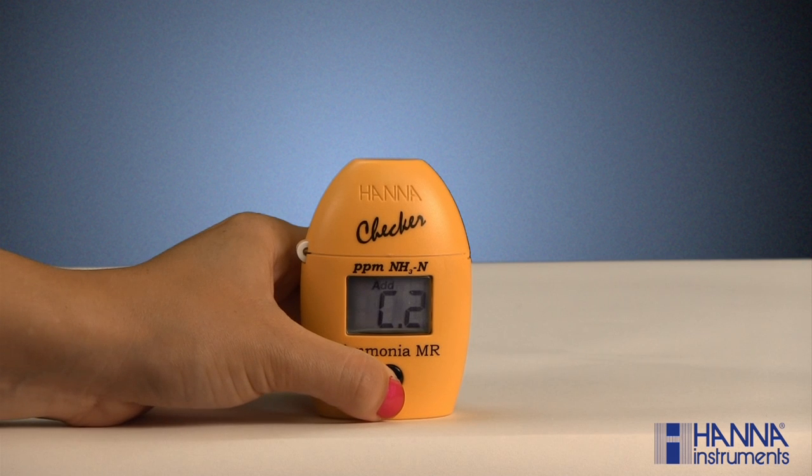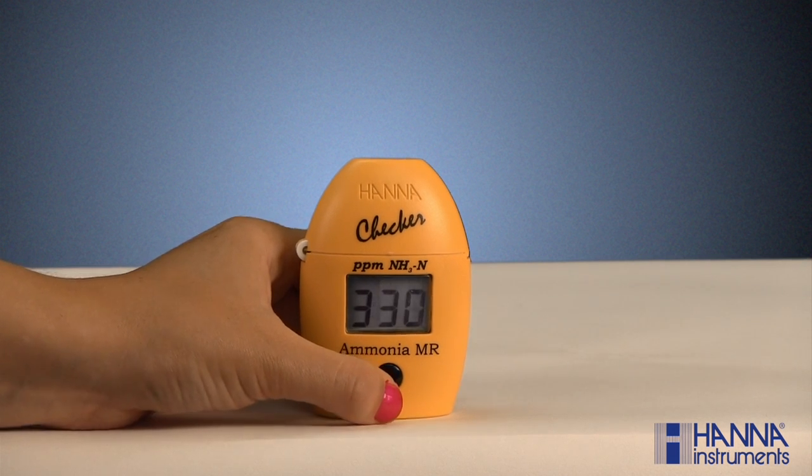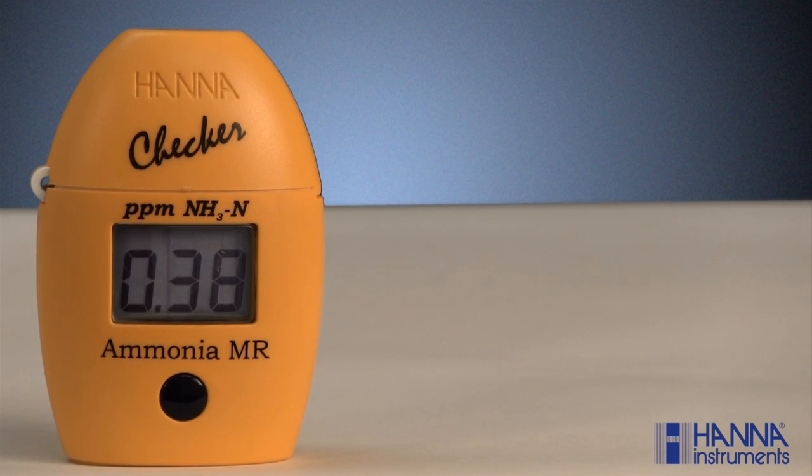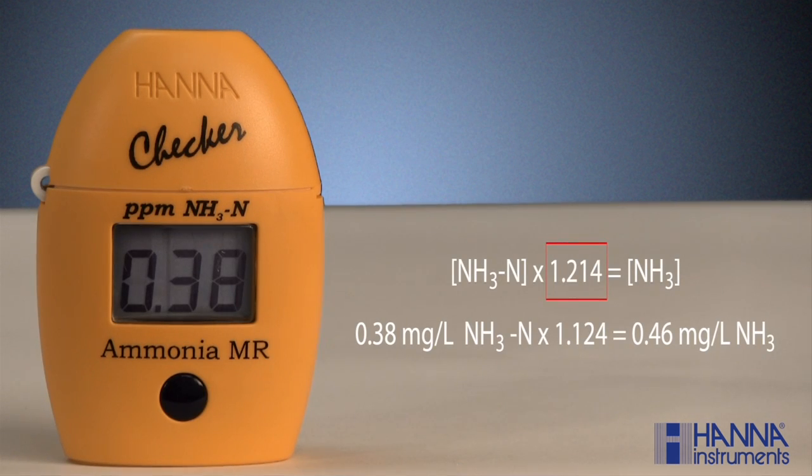Press and hold the button until the timer is displayed on the LCD. For the ammonia test, the reagents take 3 minutes and 30 seconds to completely react. When the timer reaches zero, the checker will read the absorbance and the results will be displayed in milligrams per liter or parts per million ammonia nitrogen. To convert the reading to ammonia, multiply by a factor of 1.214.